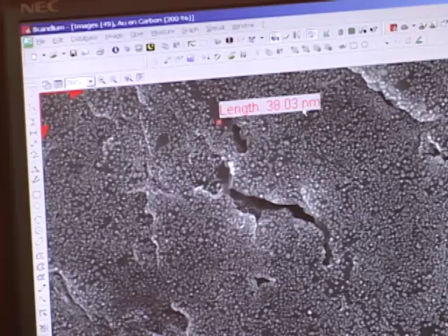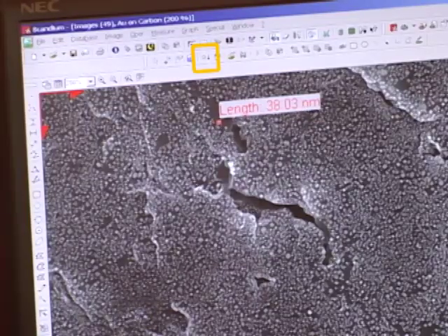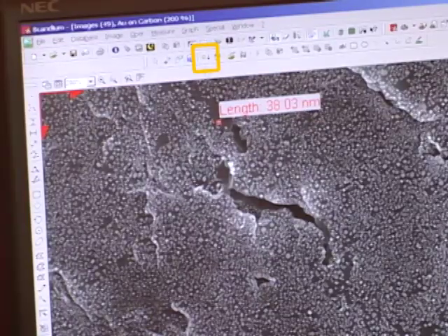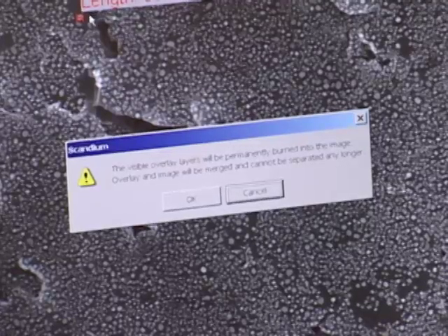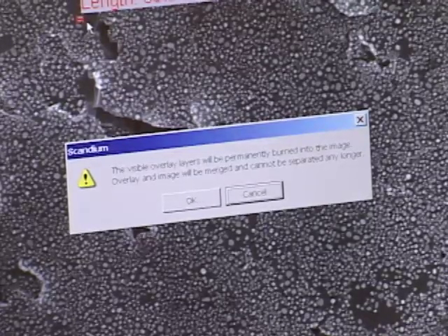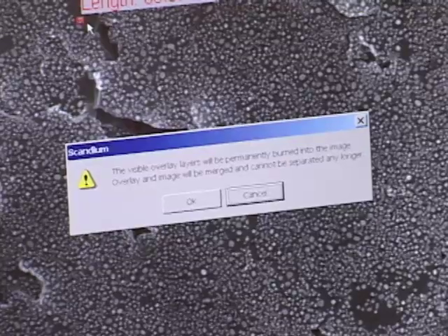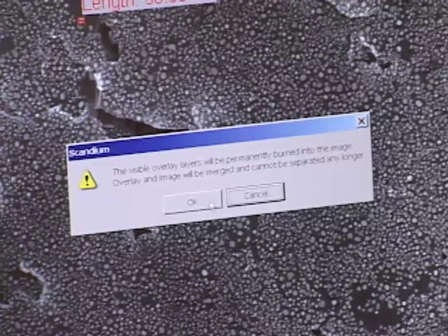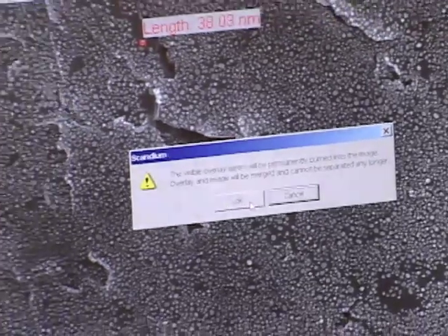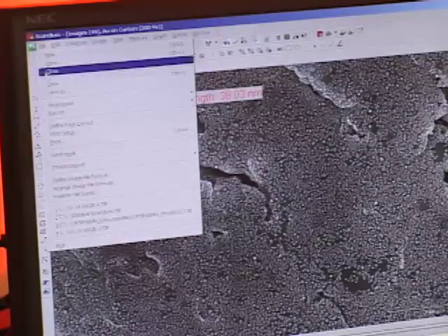I can save this image with the label on it. The measurement is already inserted onto the picture and I need to burn it into the overlay to save it. It gives a warning that all of the image beneath that label is going to be lost. I'm okay with that because I'm going to save a raw image as well as a labeled image — that way I don't actually lose any data. So I'll click OK and then file, save as.